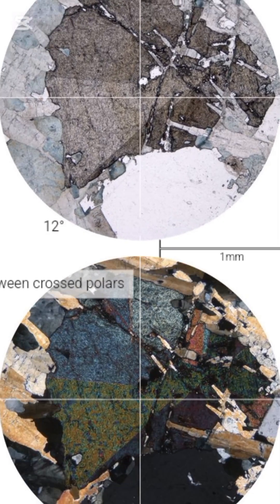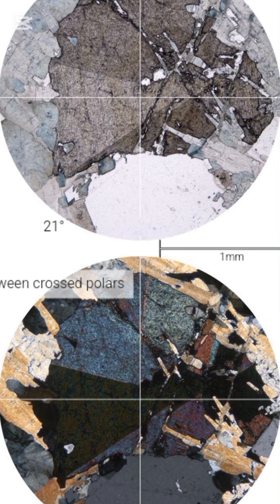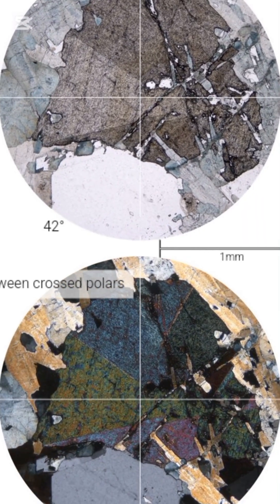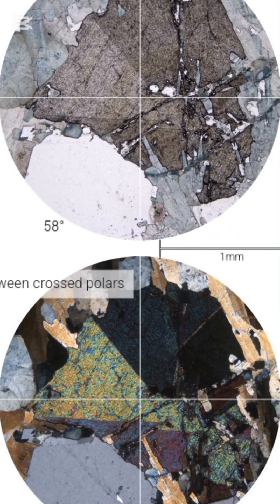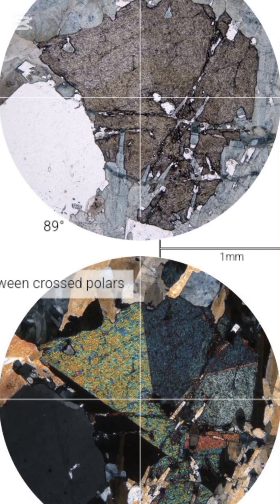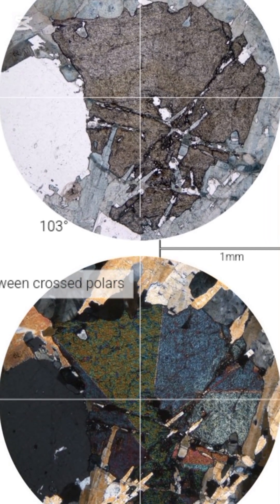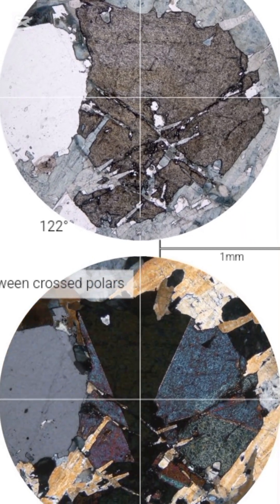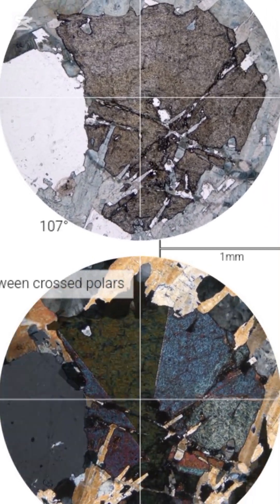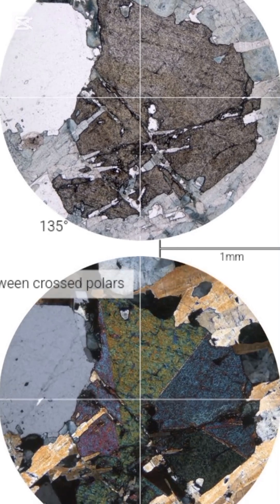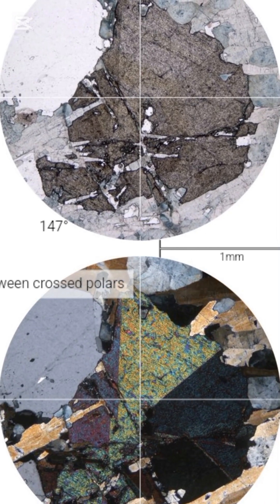This thin section shows a coarse-grained igneous texture with large grains of coarse muscovite — white mica — and altered plagioclase feldspar, which you can see in the thin section with the rotation of the stage.